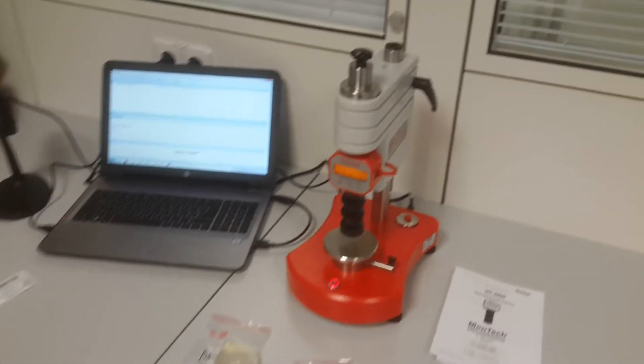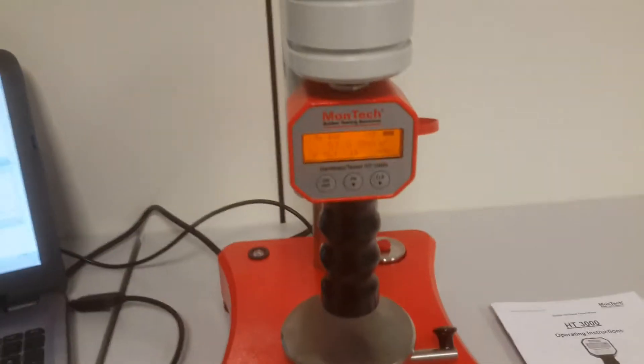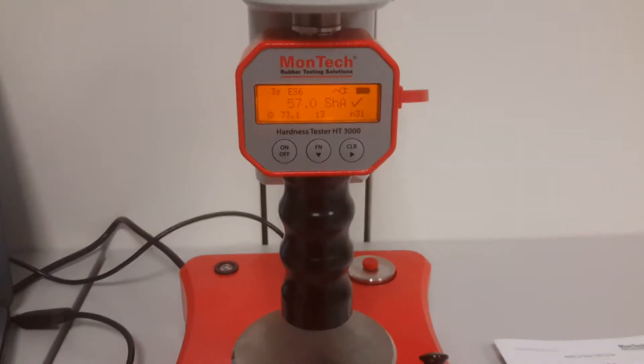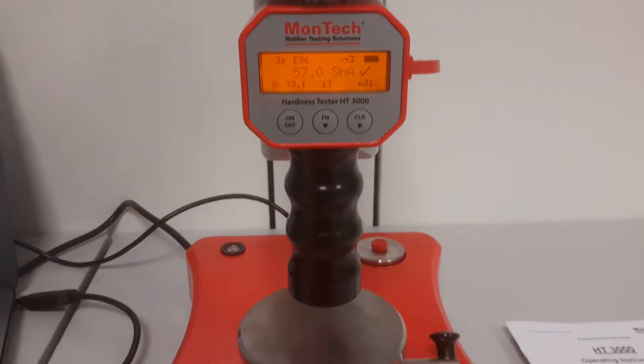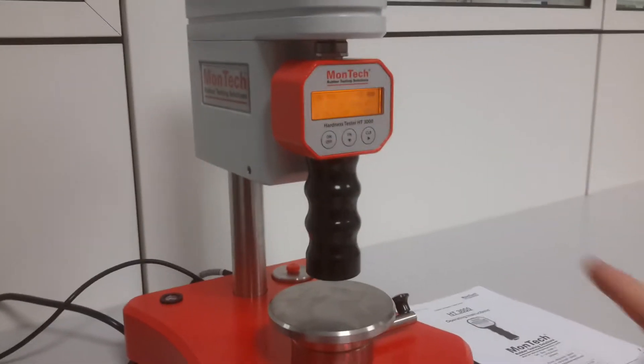The MonTech HT 3000 is a universal hardness tester, available with an automatic stand. Testing with this system is extremely easy.